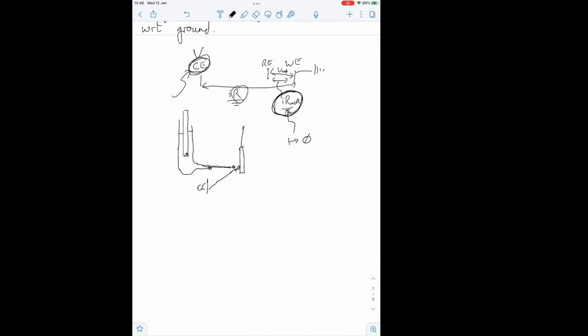Because for those that do it in the software, if I have a cyclic voltammogram that looks like that, and I'm correcting for IR drop, those that do it in the software only compress on this axis. So at this point, they've never actually applied the correct voltage, because if applied, the voltage would say plus or minus the IR drop.